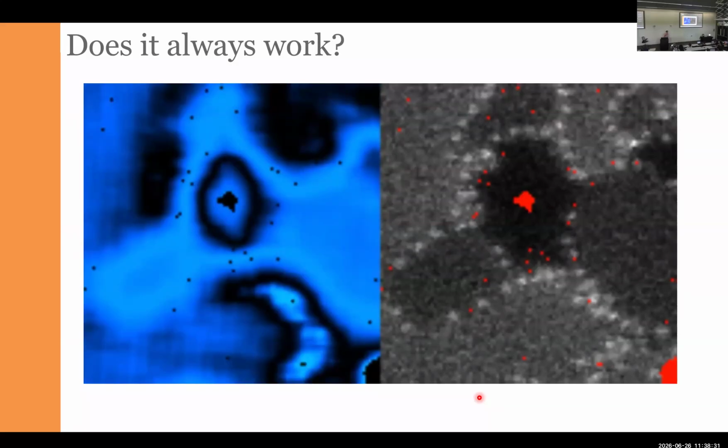The simplest example: the reward function in EELS is relatively easy to define, and it's relatively reliable because we understand what the spectrum means relatively well. For 4D STEM, our measured signal is very complicated, but the reward function that we extract out of it is very primitive. It's just center of mass. And then we started to realize that the more complex the data, but the simpler the reward function, the more the algorithms start to show weird behaviors or latch onto the wrong things.